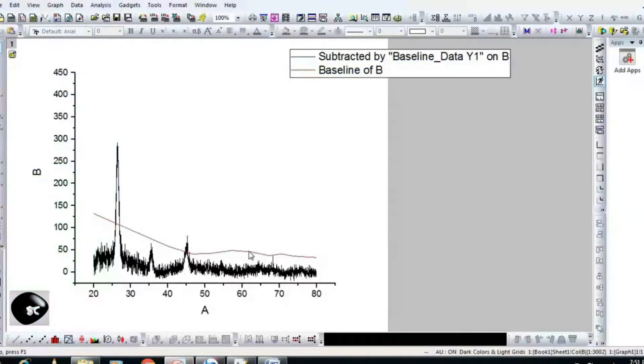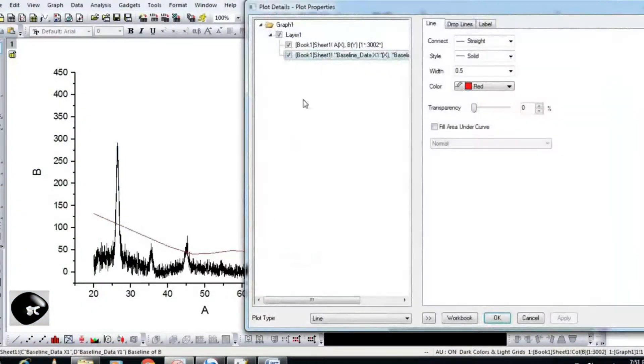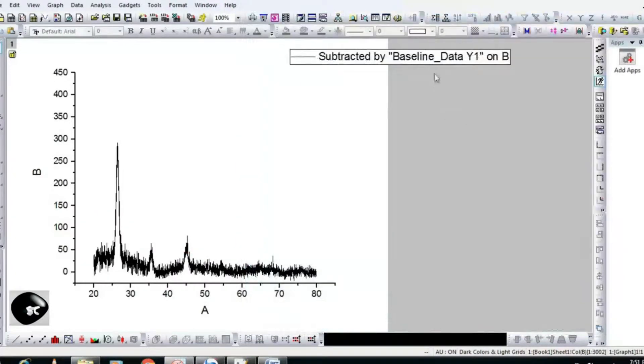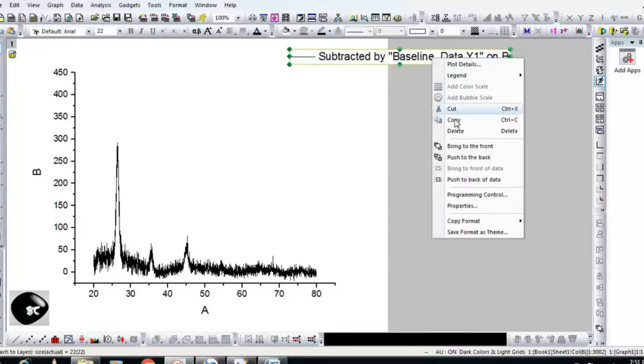Double click on the Reference Line. It will open the page named Plot Details — check the baseline data. Hit OK.